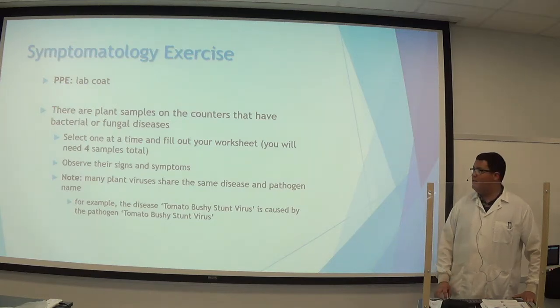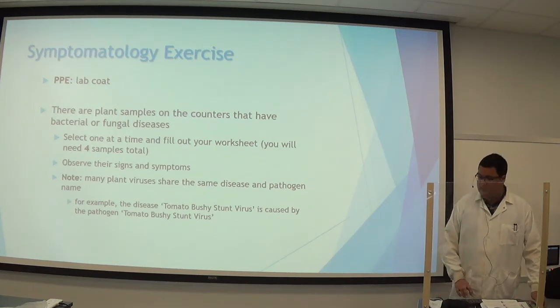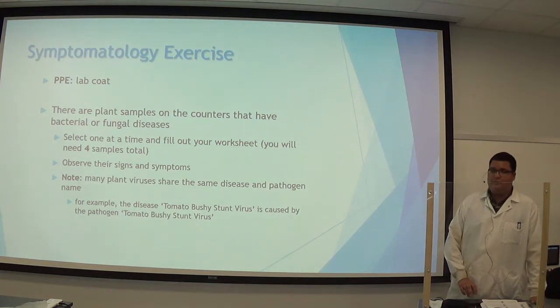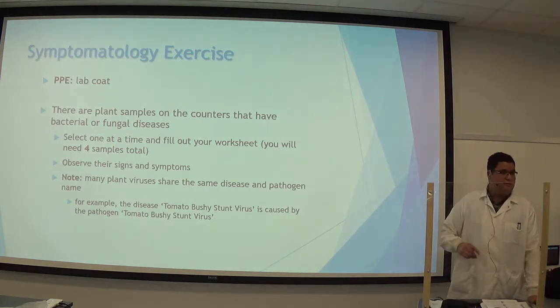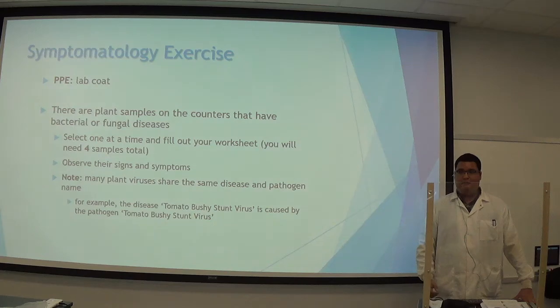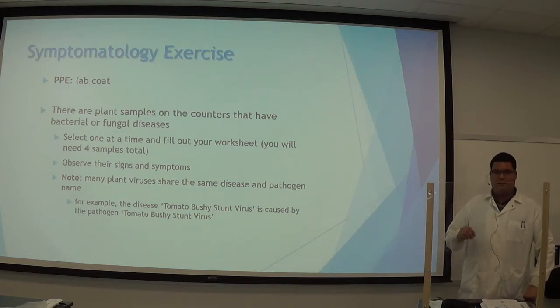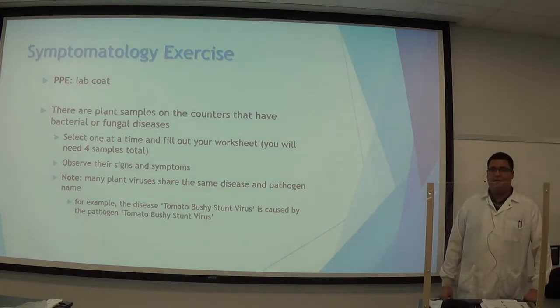Alright, so now getting into the technique portion for today's lab. Today we will be looking at some of the plants here that we brought in that have symptoms and signs of infection. We're also going to be working with last week's plates that you guys inoculated with your bacteria, or what we hope is bacteria, if you didn't contaminate your plates. And we're going to be doing step 2 of Koch's postulates.